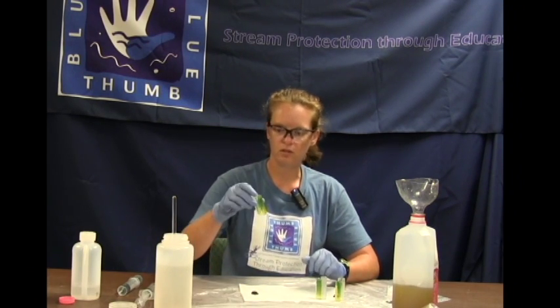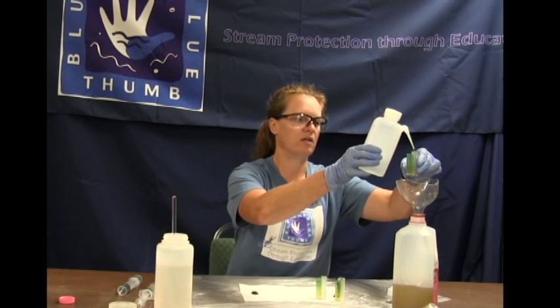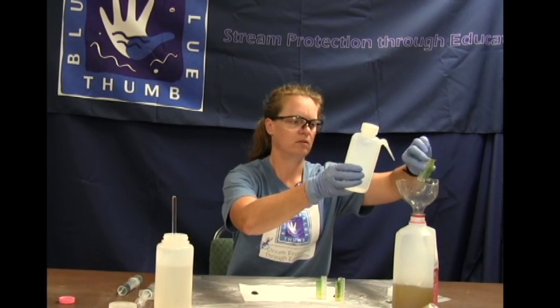So we will start with the blank as far as rinsing it anyways. So we'll rinse it 3 times with deionized water.